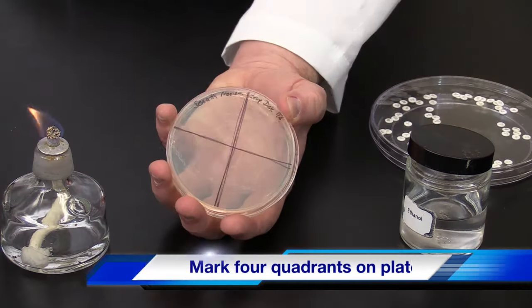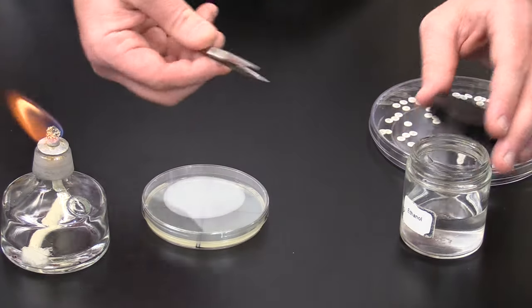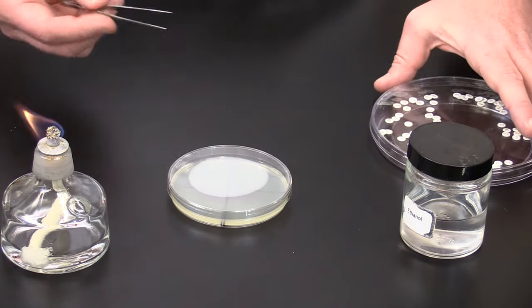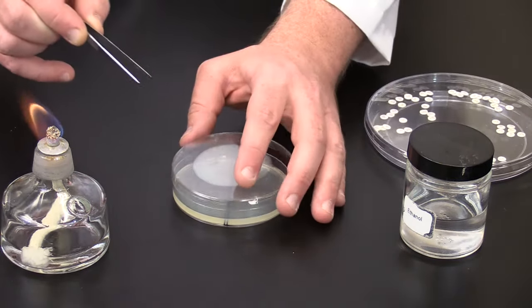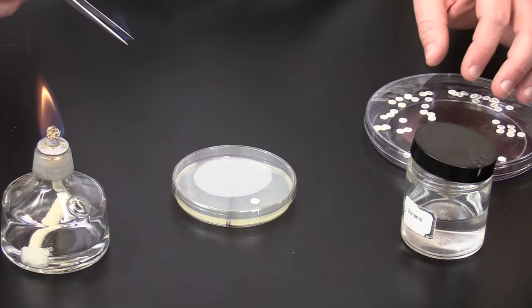With a marker, divide the plate into four quadrants. Flame sterilize the forceps and make certain the ethanol has burned off completely, and allow it to briefly cool. Pick up a disc carefully and place within one quadrant and tap lightly. Flame sterilize the forceps between placing discs.